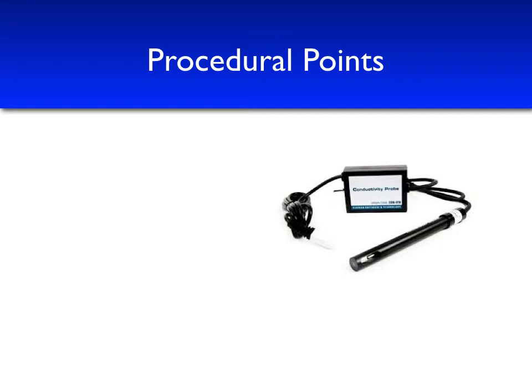The picture on the right-hand side of our screen shows the Vernier conductivity sensor. Note that it is a slender black cylinder that contains a stainless steel rod, which is a temperature sensor used to measure temperature for the conductivity measurements. The actual electrodes themselves that are used for the conductivity measurements are on the inside walls of the sensor.